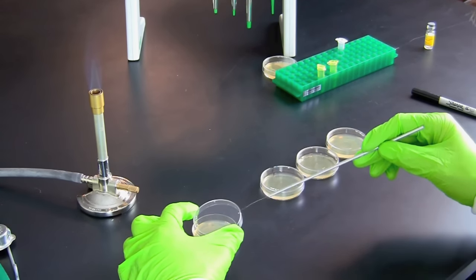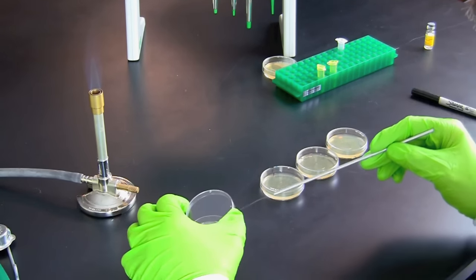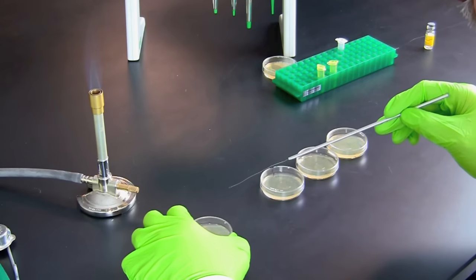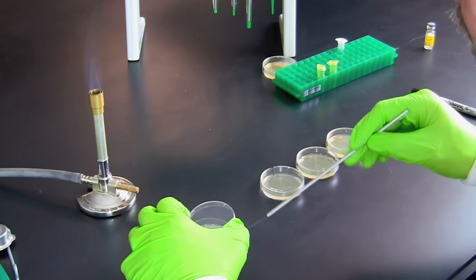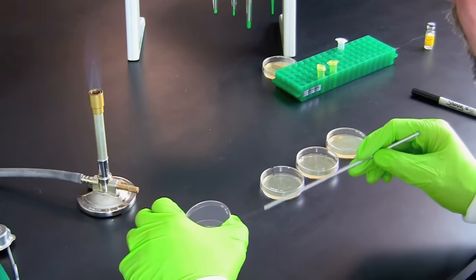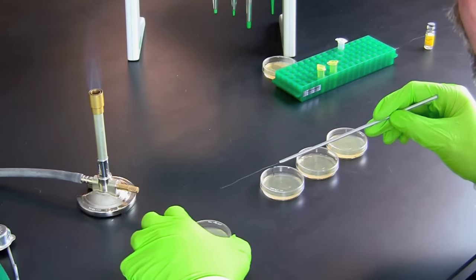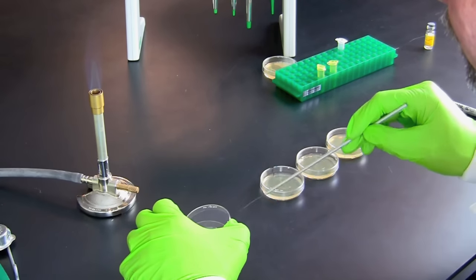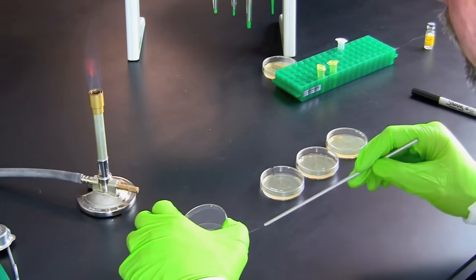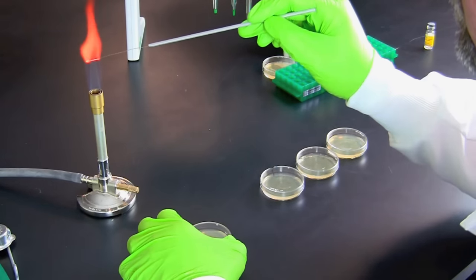Spread the bacteria over the entire surface of the plate in all directions. Rotating the plate a quarter turn between spreads will ensure the bacteria is spread evenly across the plate. When finished, flame the loop and repeat this process for each plate.